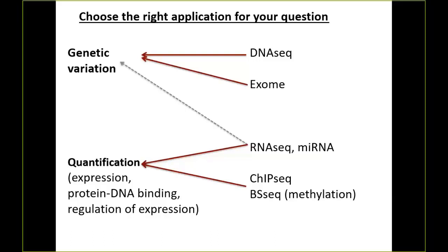So looking back at this, a lot of times when people would ask me to do variant calls using just RNA-seq, or I should say specifically variant discovery using RNA-seq, unfortunately I was put in the position of telling them that there's definitely no variants of interest in beta-actin. Again, beta-actin is a super highly expressed gene, guaranteed to get a lot of reads over the entire mRNA for beta-actin. And I could tell them no variants in beta-actin.